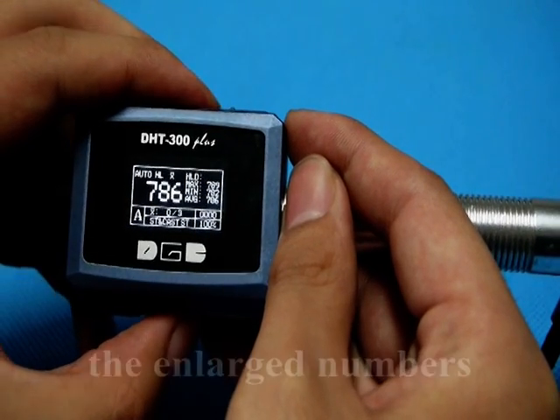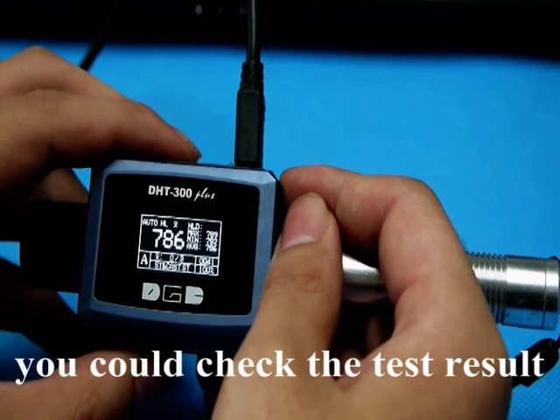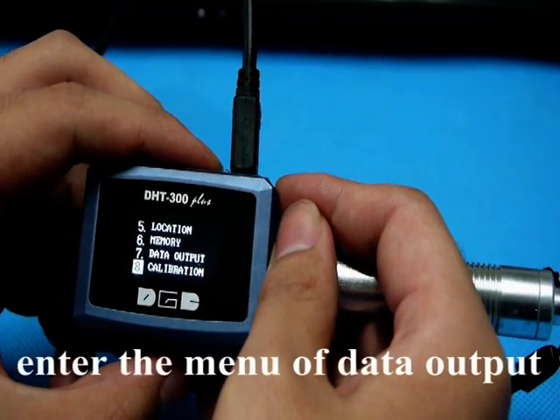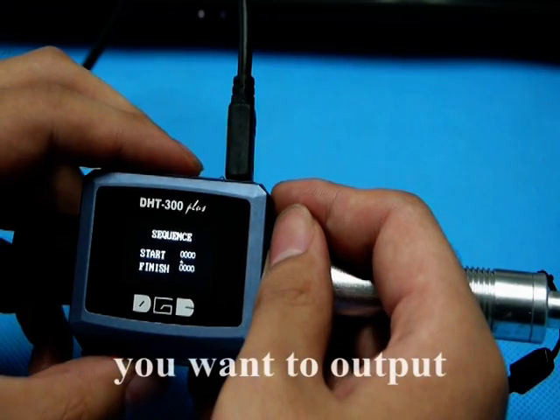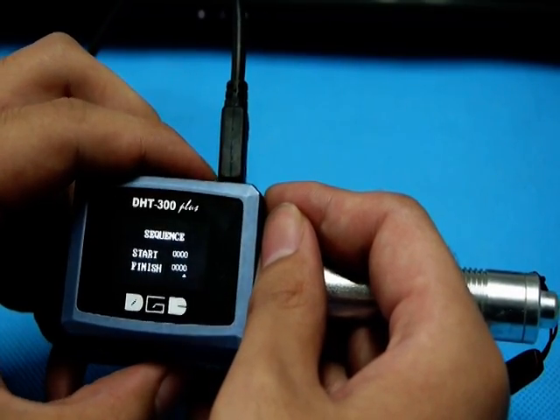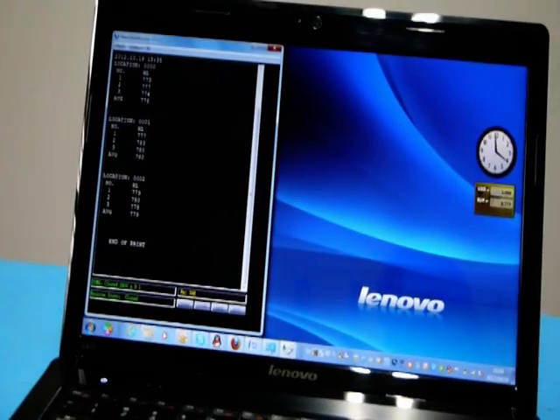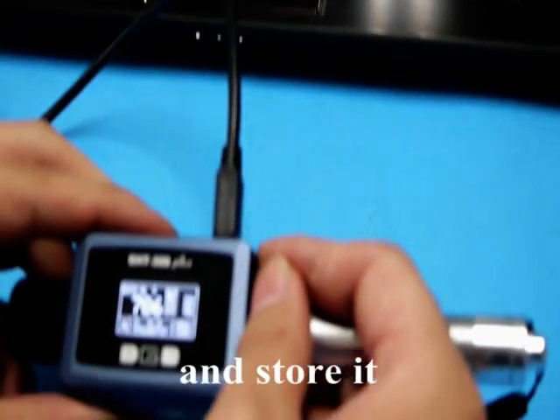You could check the enlarged test numbers by pressing the ARP key. After that, you could check the test result through our software and transfer to PC. The process is to enter the menu of data output, choose the data series and the number you want to output, and press the confirm key. You could see the data on the screen and store it in different formats.